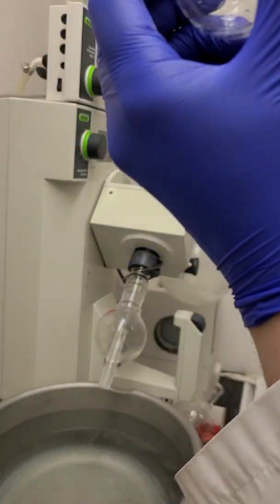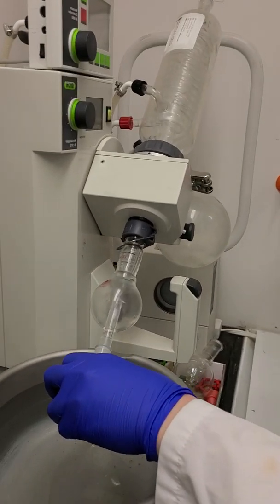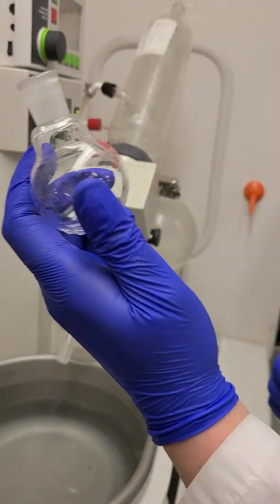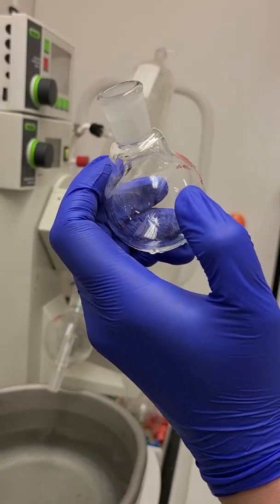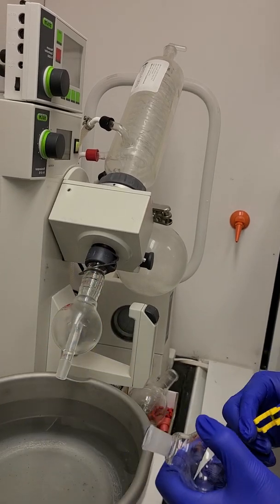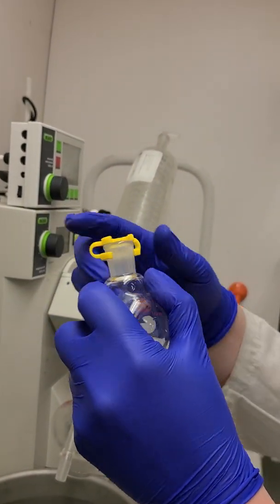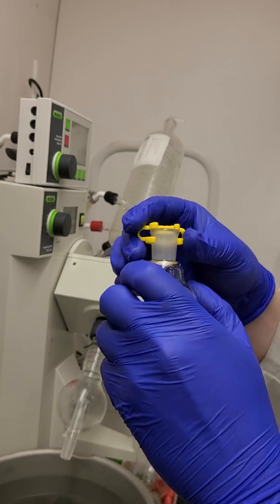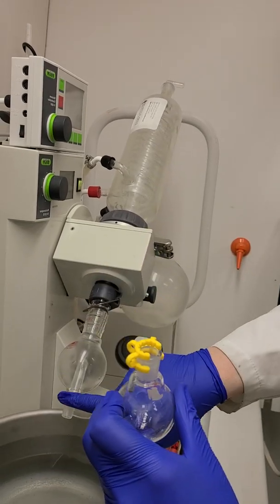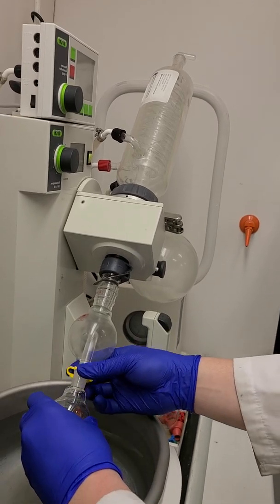Once you have your solution that you want to evaporate, take it and connect it like this. But what you need to do is make sure you have the right clip. If you don't have a clip, this will fall off and you could potentially ruin your sample or break the adapter. So the way this works is you put this on, right? You have to check whether or not it's the right size. This top part has to be the adapter for this part. So you have to make sure that it's correct on both scales. What you do is stick it on and just clip it.